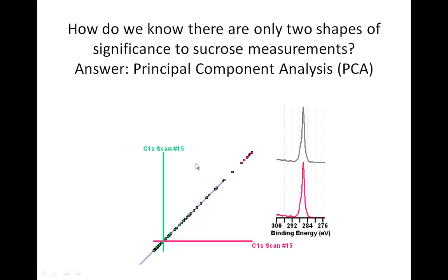While principal component analysis, or PCA, makes use of linear algebra and the solution of eigenvalue problems, it can be explained in terms of a scatter plot and what we see in a scatter plot that is formed from spectra. In 2 dimensions, when we have 2 spectra, we can plot a set of points determined by pairing up the data bins from these spectra and using the intensities as the coordinates along these axes.